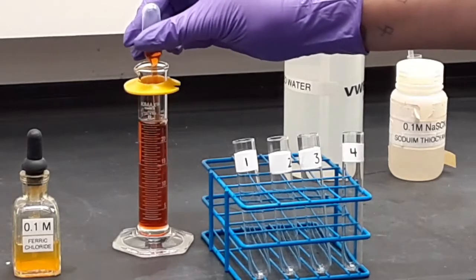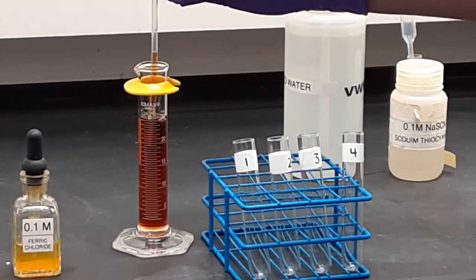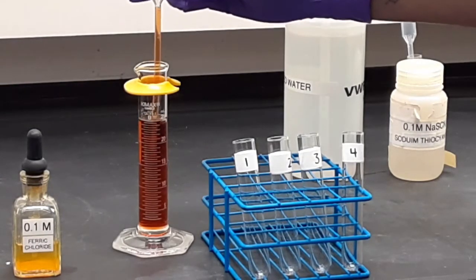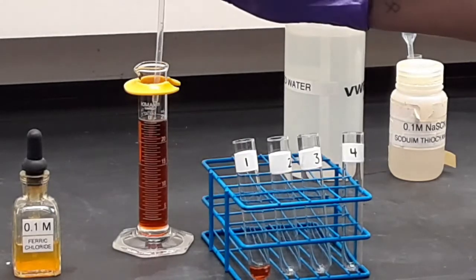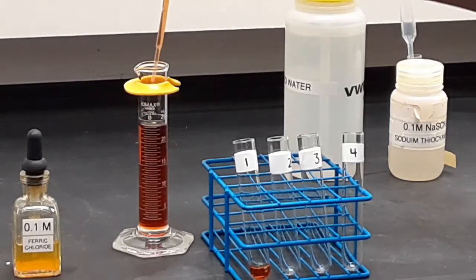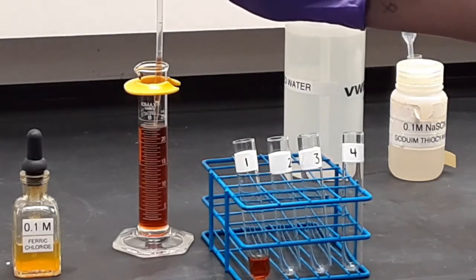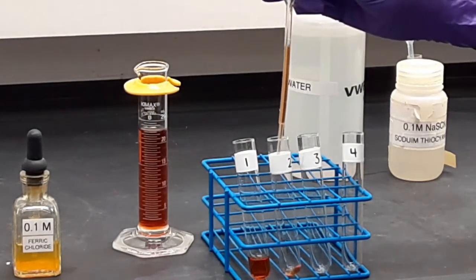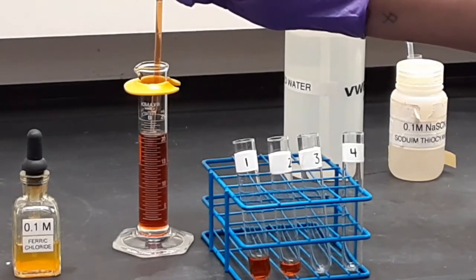Mix the sample. Now remember, these pipettes are graduated. The stem of the pipette holds almost exactly 1 milliliter.